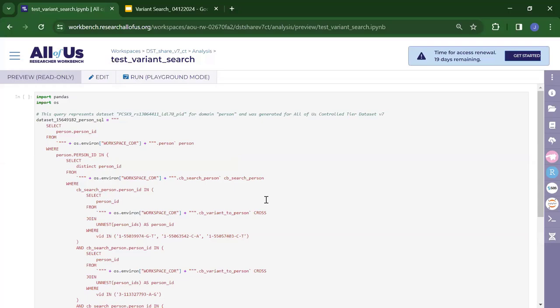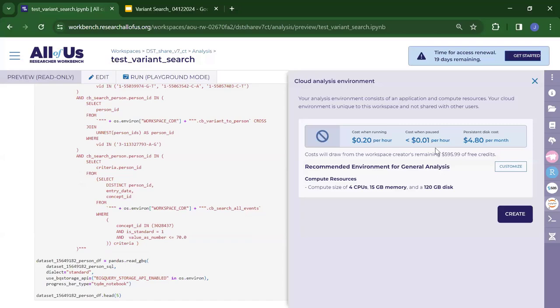From the very beginning to now, everything has been free. In the dataset builder, you can view the cohort demographics such as age distribution, gender distribution, and race distribution — all free. Unless you want to get the actual person IDs, you need to create a general analysis environment, which is sufficient. Then you can run the notebook to get your person IDs. That concludes my live demo of the variant search feature in the cohort and dataset builder.